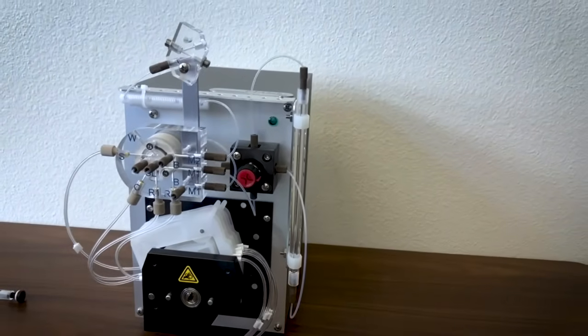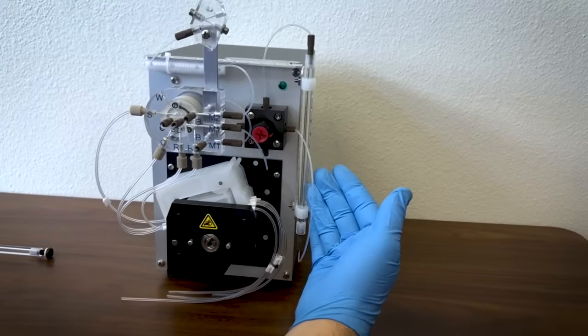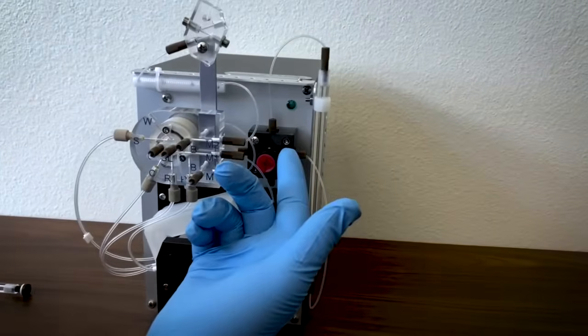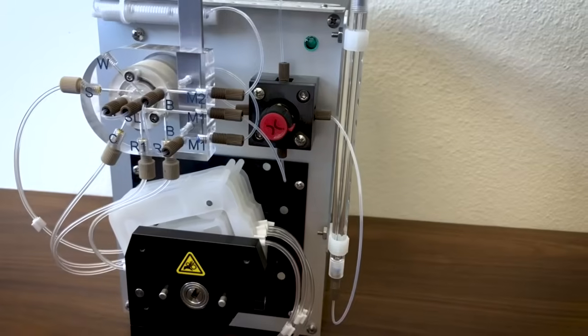This is how a FIAlab column looks installed on an instrument. Before starting, ensure the switching valve is in the off position. Be sure to wear gloves throughout the process and clean any drips with a damp paper towel or Kimwipe.